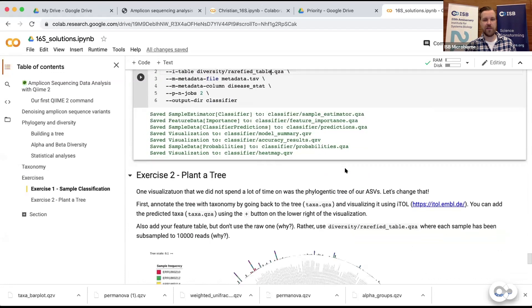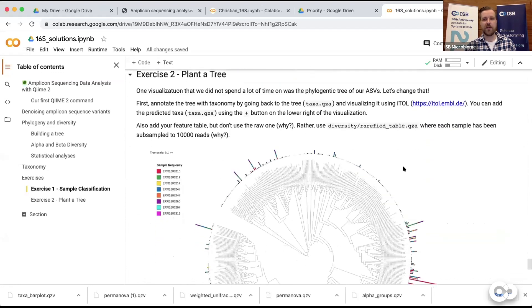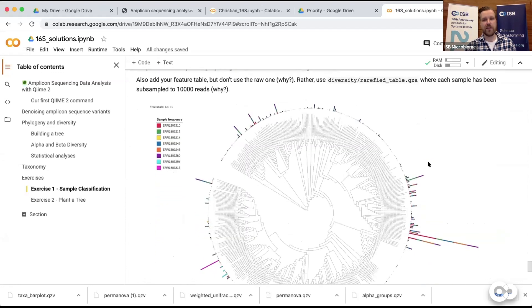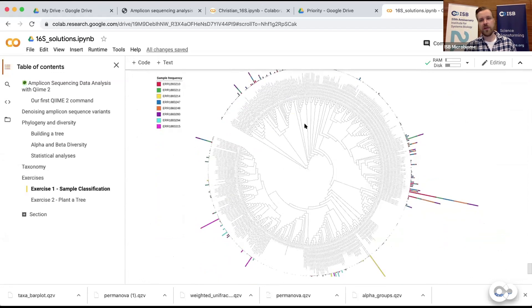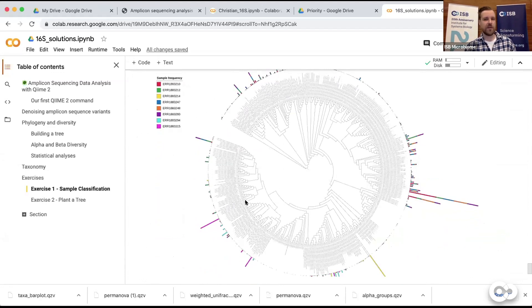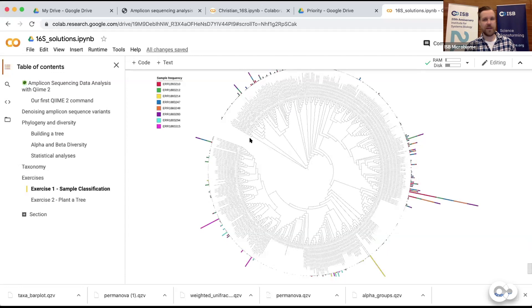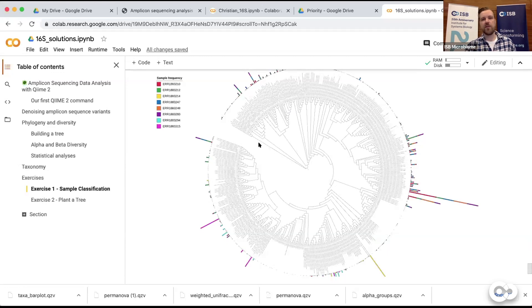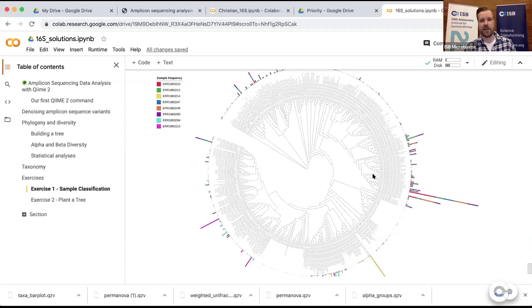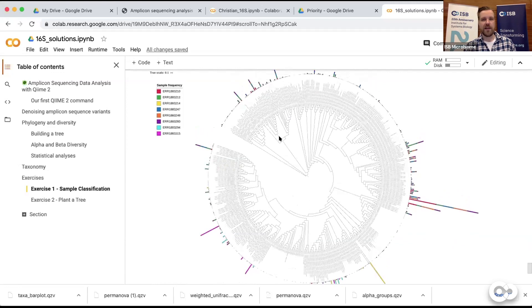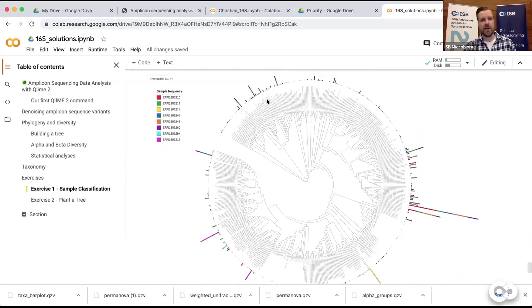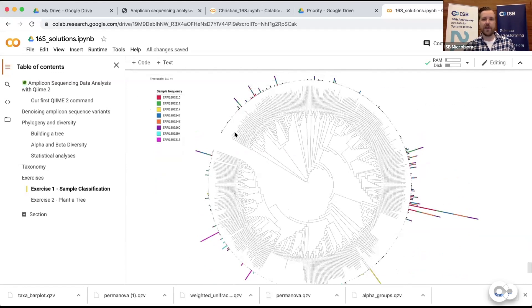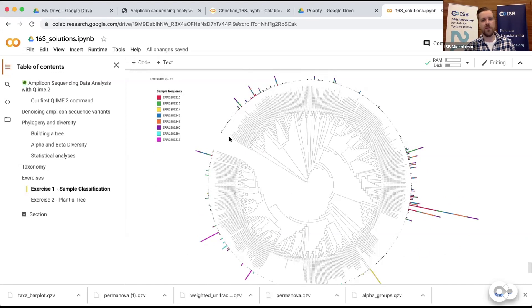In the second exercise, I had you visualize the phylogenetic tree a little bit. What I did here is I loaded the tree and said ignore the branch length, so yours might look like a distorted version. What we have here is often called a cladogram. It's still exactly the same thing - if two things are close they are still very similar - but the length of the branch is not directly associated with sequence-to-sequence similarity. It's just a way to show it so it all has the same maximum length. Then the first thing that happened is if you imported the taxonomy data it actually changed the names of all the leaves. Before you had those weird random IDs for the amplicon sequence variants, and now they got substituted with the actual taxonomic classification.